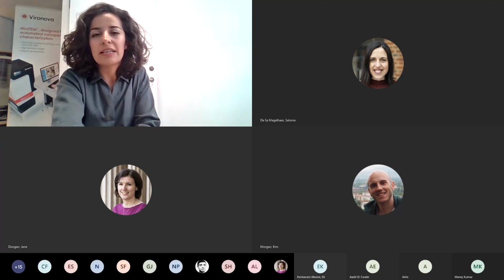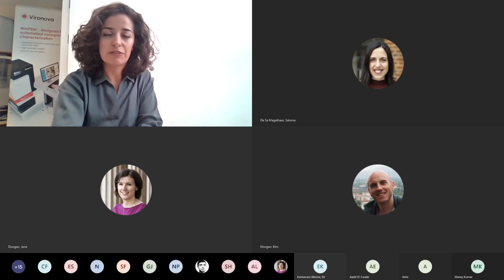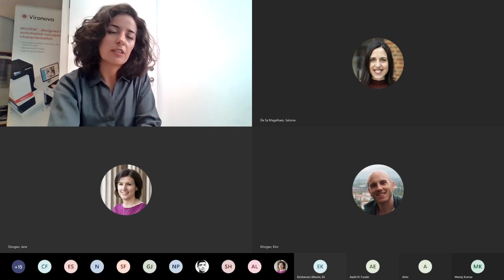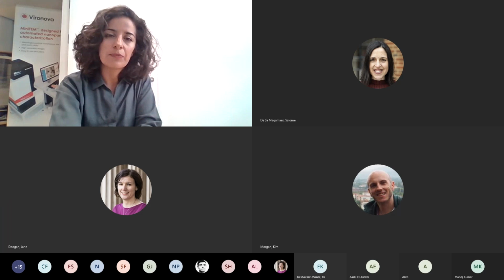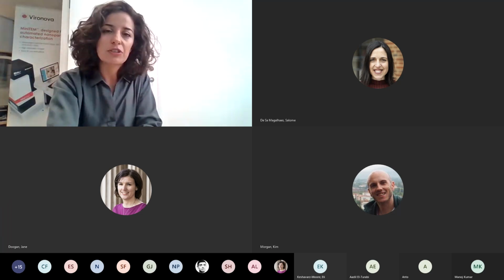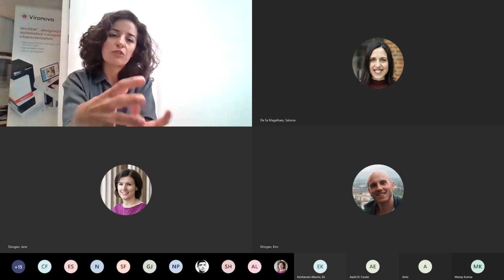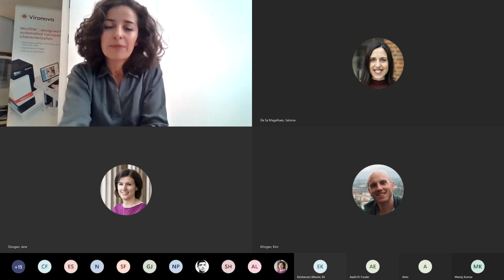As Salome mentioned, my name is Saba Hussein-Gore. My background is in virology. I've also worked quite a lot on membrane proteins, so I've done a lot of expression and purification using a whole range of different cell lines, and I've also got experience in microscopy and using the MiniTEM, and for this purpose, that background has really come in handy.